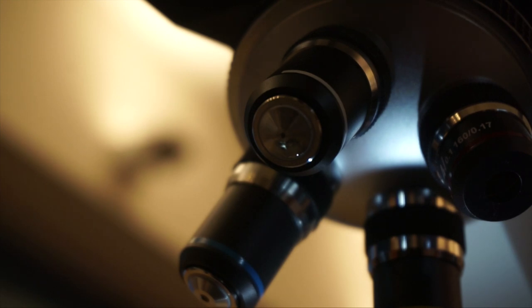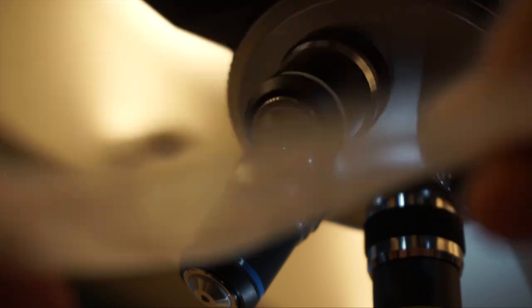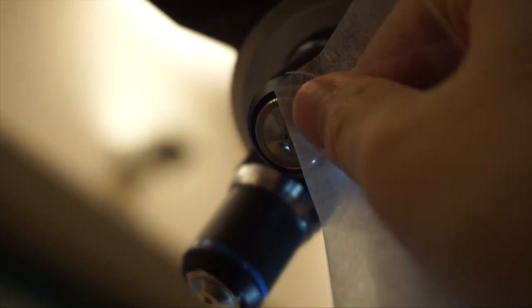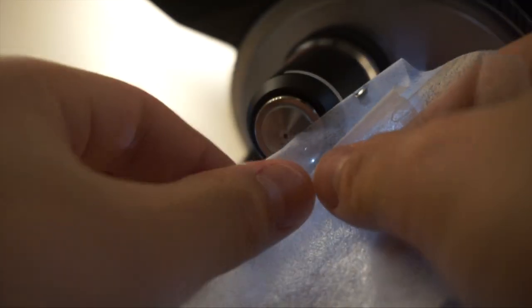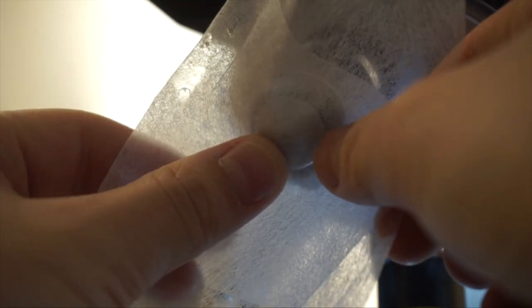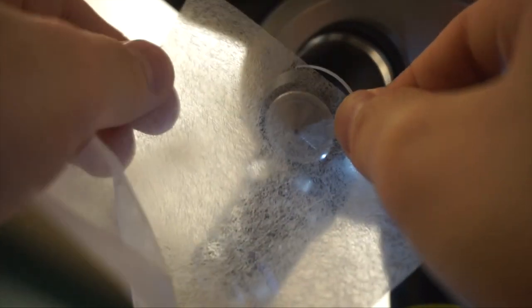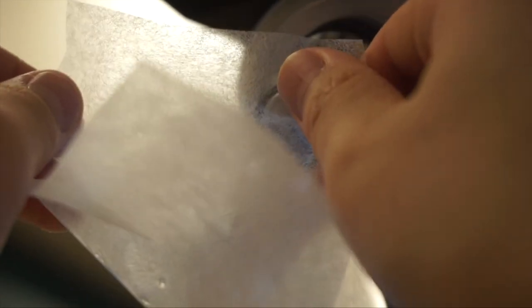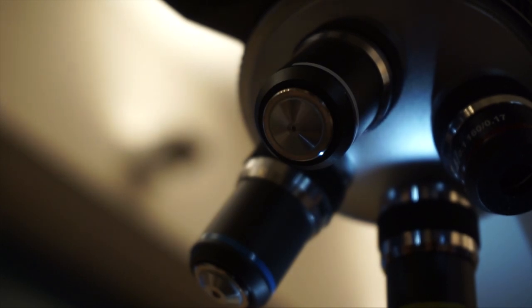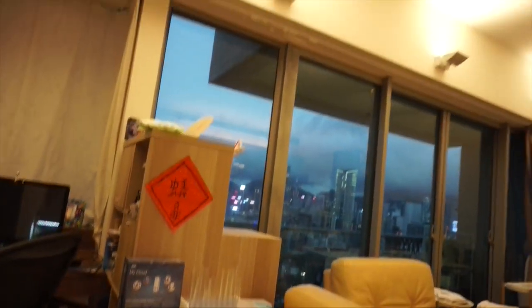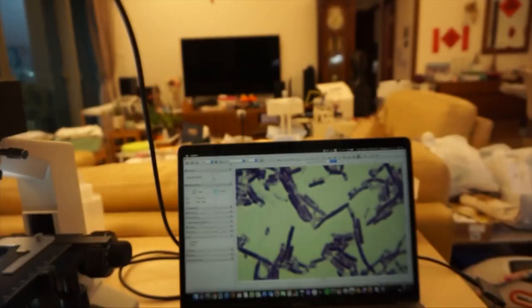So here you can see the oil. We take our lens cleaning paper and we gently fold it. I like to fold it in half. And wipe the edge. Don't wipe the lens quite yet. Just wipe that, the outside of the lens. Don't wipe the lens right now. And then now unfold it into one single sheet. And then you can wipe the lens. Wipe the oil off the lens. And then throw the sheet away. After throwing the sheet away, this is just a still image, so that's why it's still on.